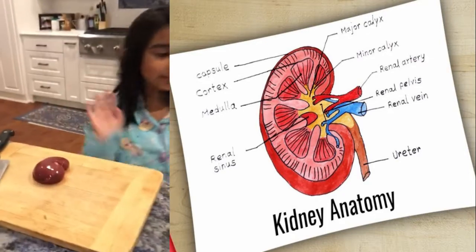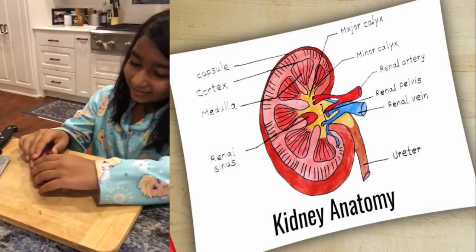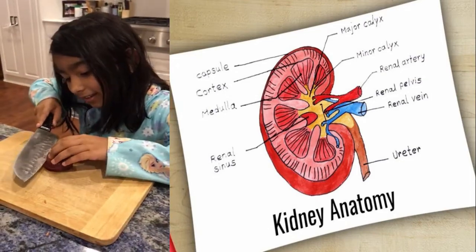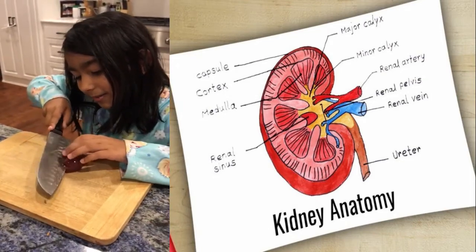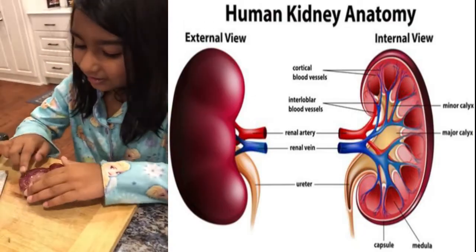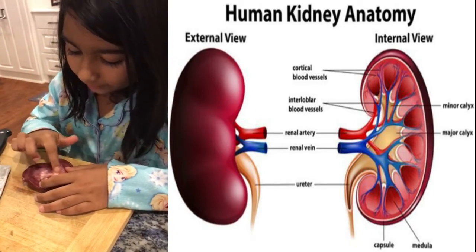So now I am going to show you the real kidney. Now I am about to cut it open from the side. Here we go. So these are the three layers: the cortex, the medulla, and the pelvis.